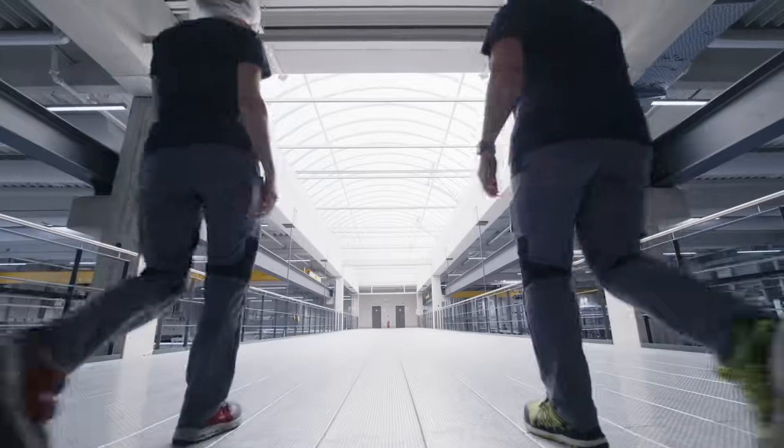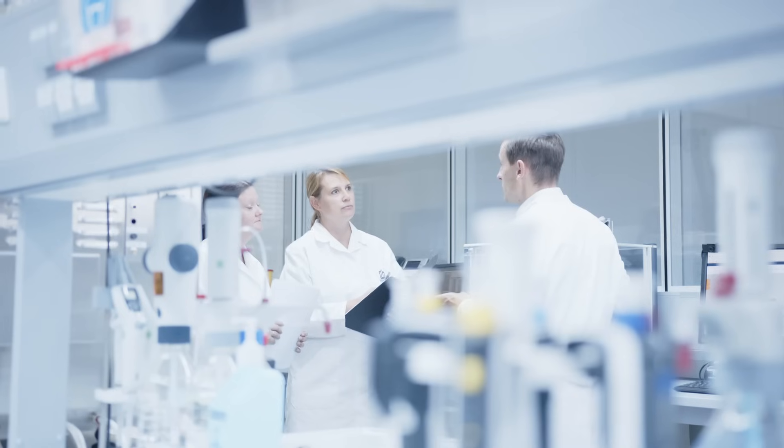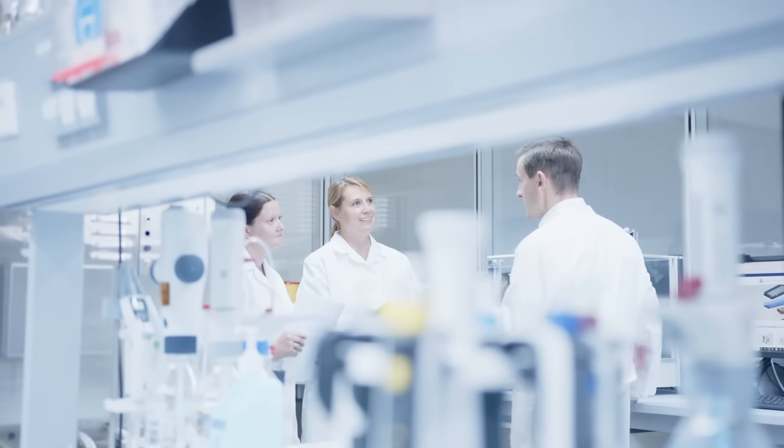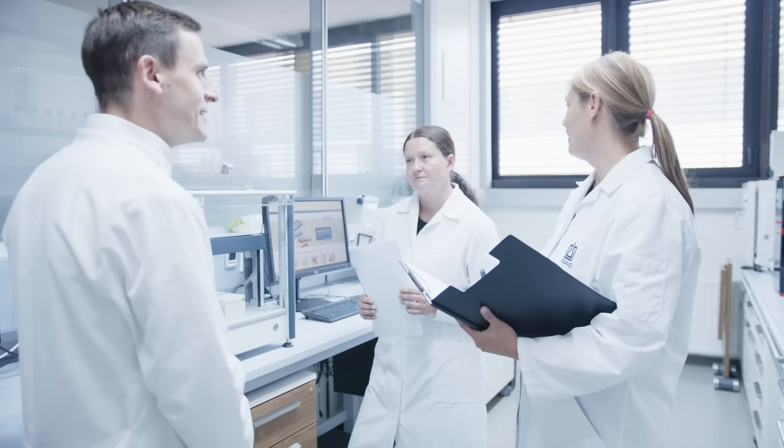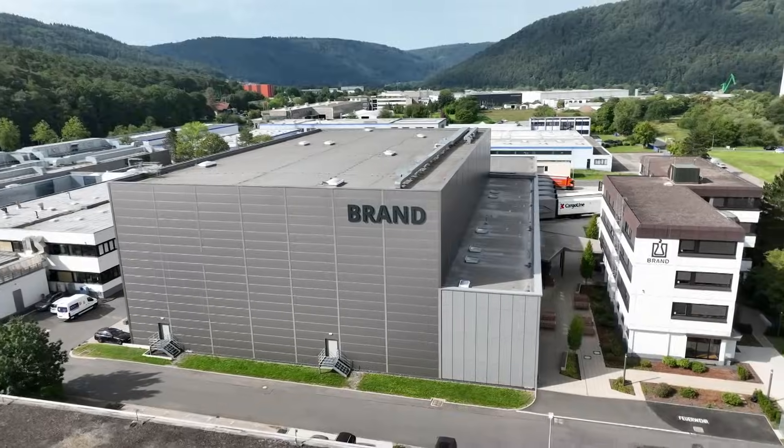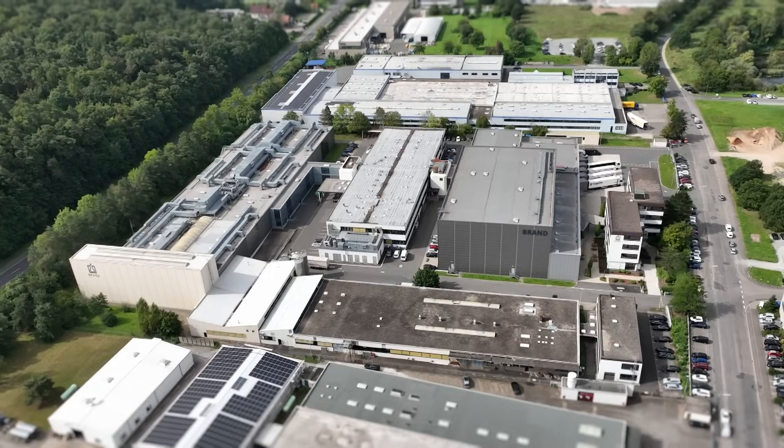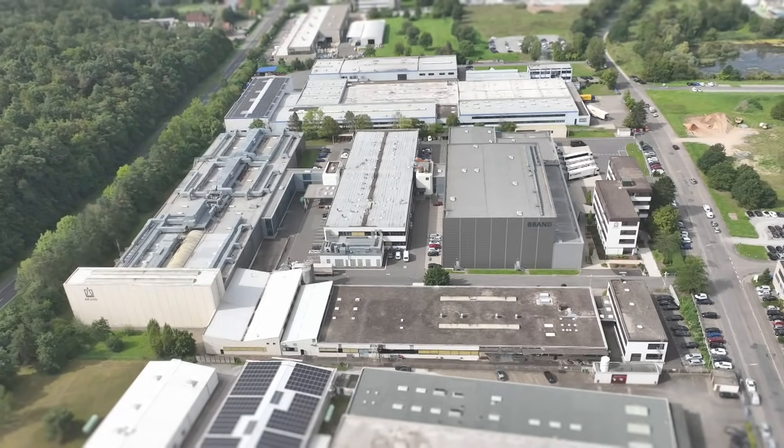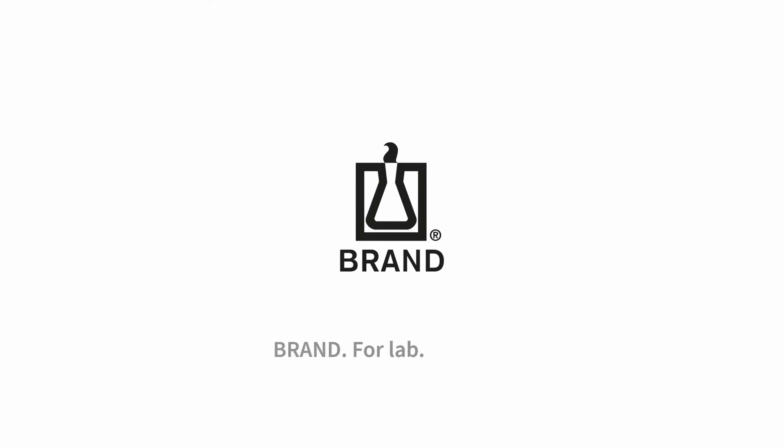Our vision: be your trusted partner and worldwide reference for precision volumetric measurement and performance plastics in the lab. Find out how we can make your lab work more simple, easy, and efficient. Brand, for lab, for life.